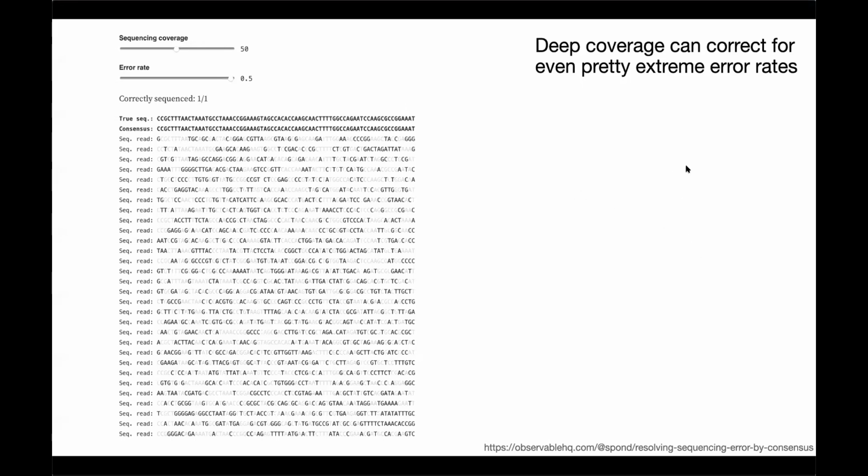Now, I don't have the slide, and I'm not going to go back to it, but the SRA metadata that I showed on the second and third slide showed there was a coverage of 6,000, right? An average coverage, which basically means that each position is covered by 6,000 independent reads. This should indicate to you that, even if this is not uniform and there are still going to be some errors, by and large, with this much sequencing depth, just using this idea of majority rule, you'll be able to recover the true sequence in the vast majority of genomic positions.